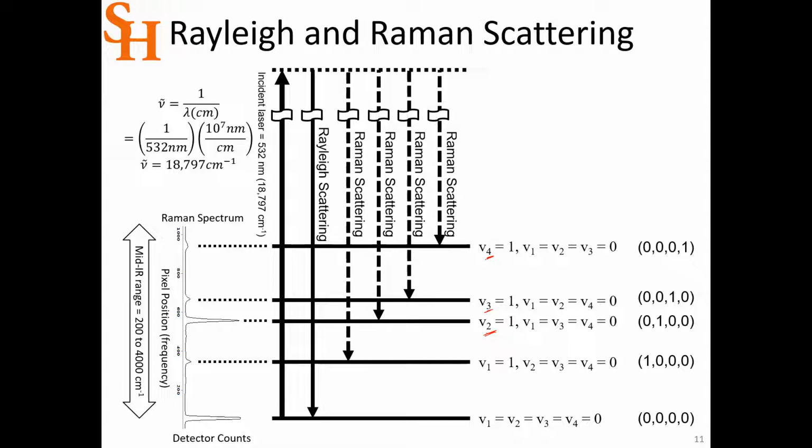So if you were really meticulous and you got in there and you assigned all 30 vibrational modes to a spectroscopic signature and you're able to support your assignment, you could publish that with the data that you get in this lab. Okay. It's a pretty tough job though, because there are 30 vibrational modes that are allowed in the Raman and the IR. And so you'll see how busy the spectrum is.